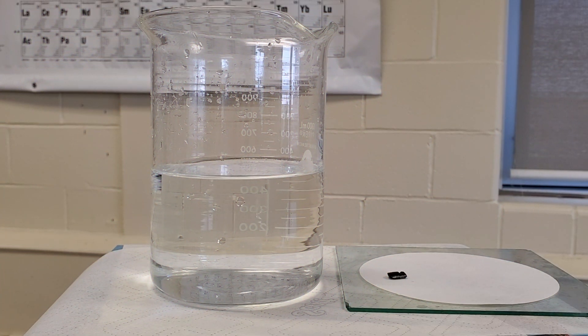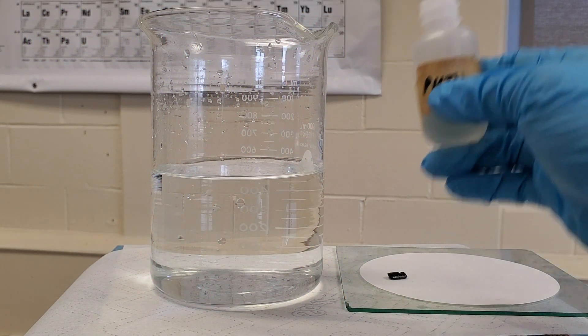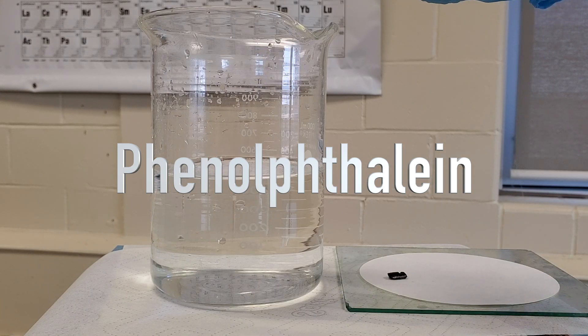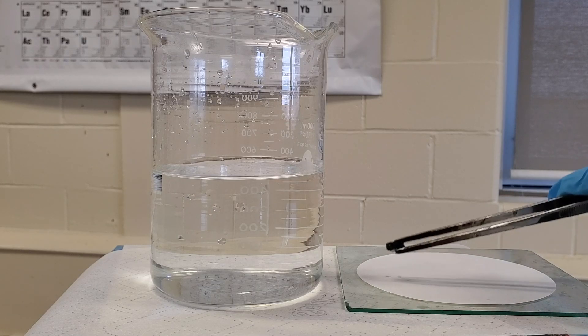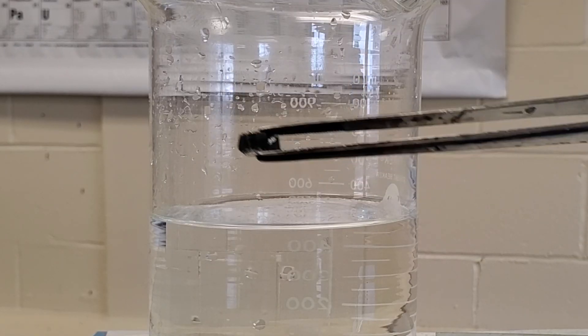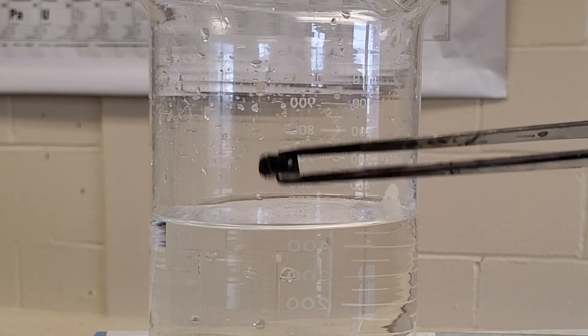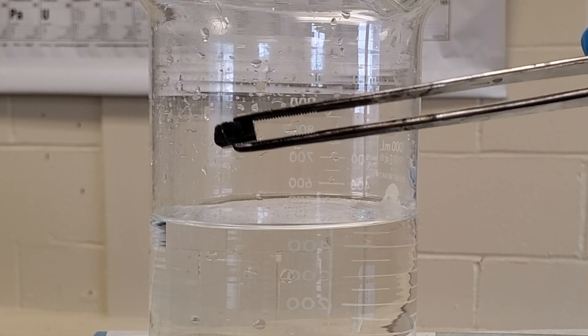Here I have a beaker of water. I'm going to add a drop of phenolphthalein indicator which turns pink in basic or alkali solutions. You can see the lithium sample has already reacted with the oxygen in the air and is no longer shiny but is now dull gray. Let's drop it in.